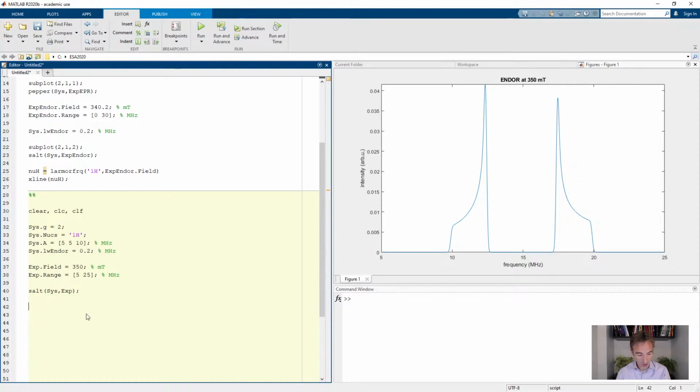Actually, we can test that right away. Let's go to W band. It takes only 3 lines of code. If you would go into W band in the lab, it would probably cost you a 7-digit number of money, and maybe a year or 2 before you get it.